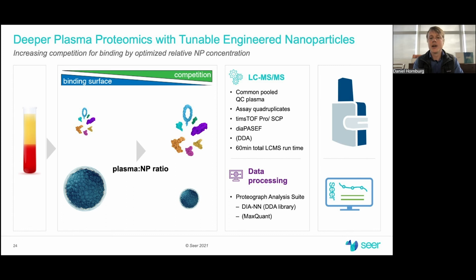on the surface. We read out everything with a standard LC-MS/MS method, here a timsTOF Bruker system, and data was analyzed with DIA-NN. I'm only showing DIA-NN data here, but we also did an analysis with MaxQuant. The absolute numbers, if you go for different search engines, differ, but the overall conclusion is the same.